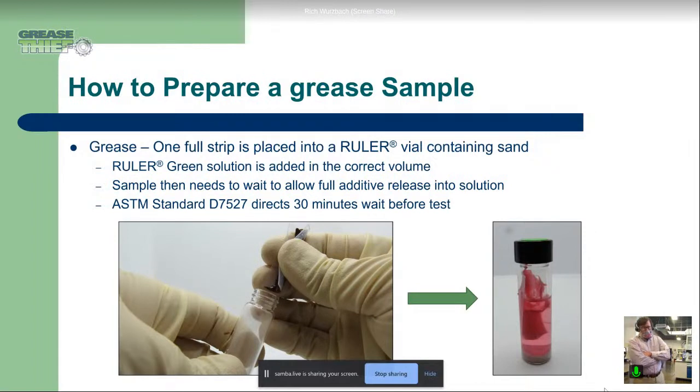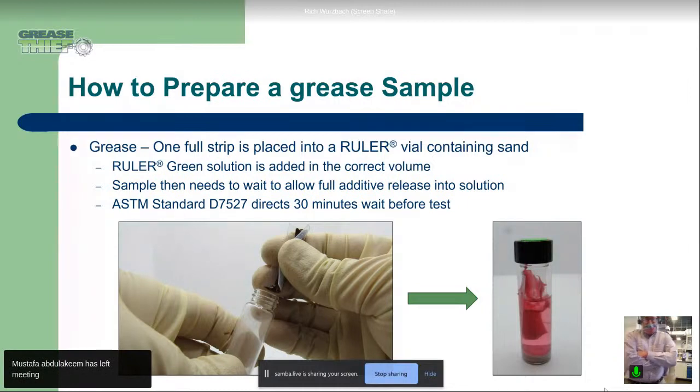And that's why we prefer this method of the thin film that's consistently and uniformly extruded out on the substrate, so we don't have to worry about the variability of someone's ability to wipe that thin or leave little chunks inside or what have you. So that's a difference here between the method that we use, which falls under D7918, versus a more manual approach, but both can be done, and the key is consistency.